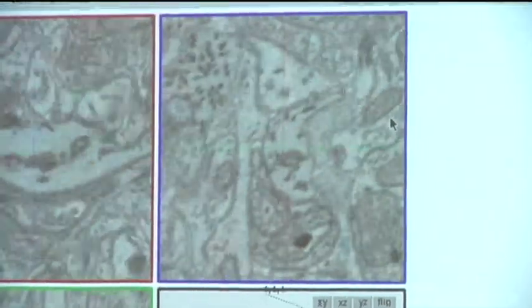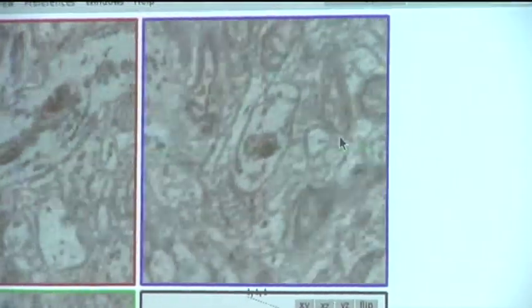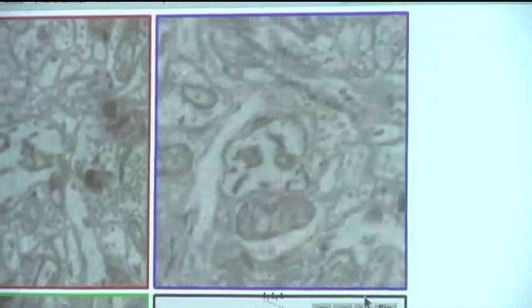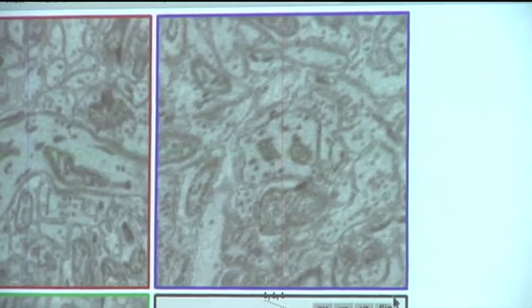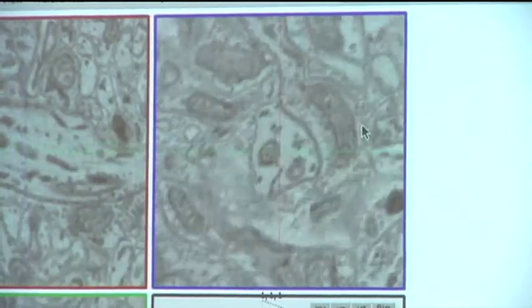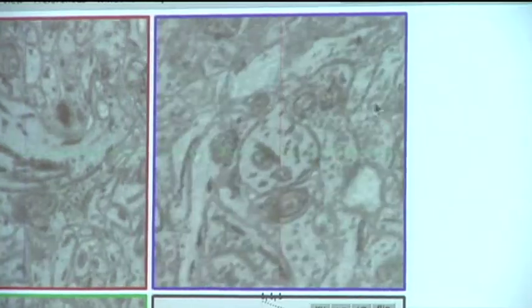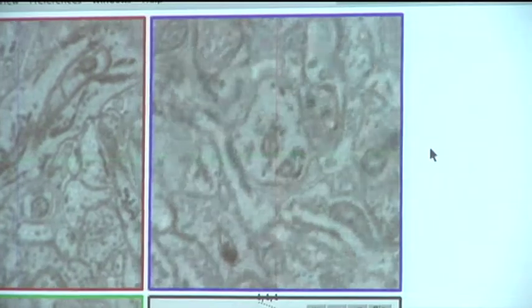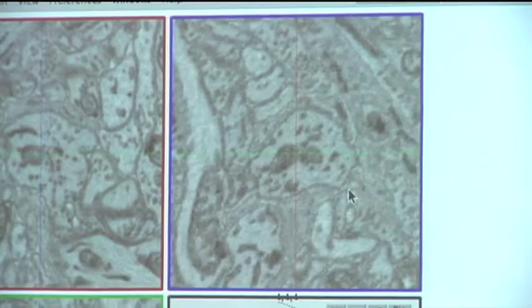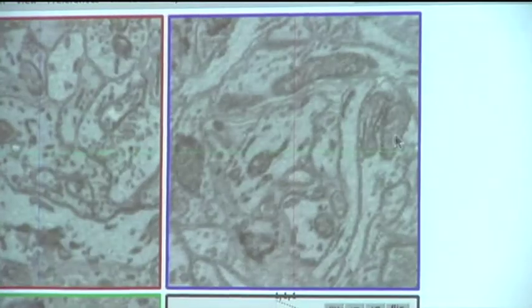So you're traveling through the retina right now along, actually, excellent. Got a bit lost. No, you're still doing it well. Very good. Further, further. You can see all the stuff that's happening around it, also exciting, but we want to focus on this particular neurite. I think recentering your mouse would help. Yeah. Okay, very good.